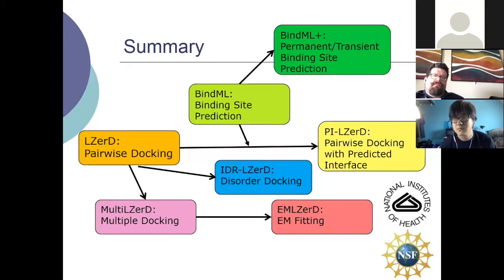Then I try to find if such a distribution of surface points has ever been recorded in the database or not. The hashing gives a very quick search of that particular orientation. Then we pick up that orientation from the database, and if it matches sufficiently well, we build a 3D model and make sure that there are no atom crashes and so on.